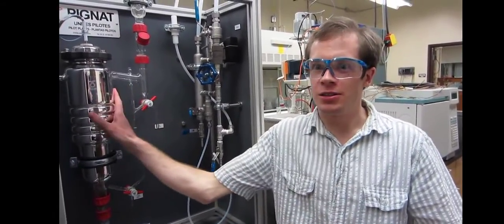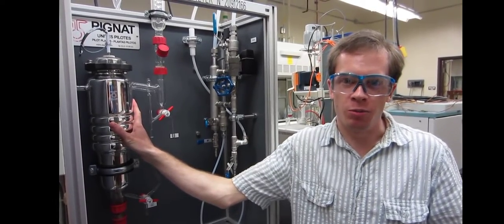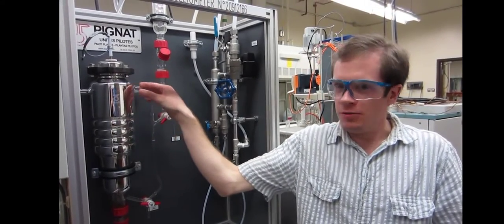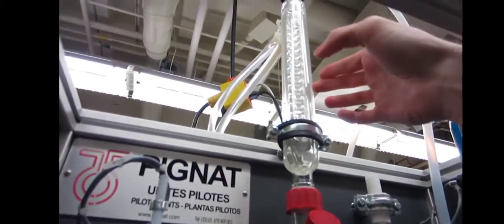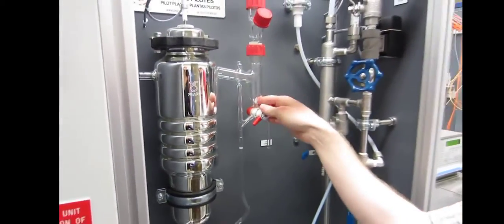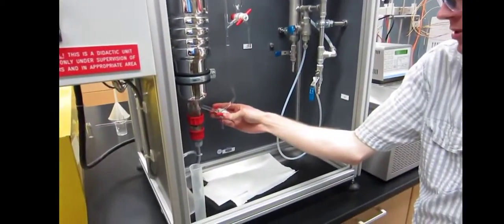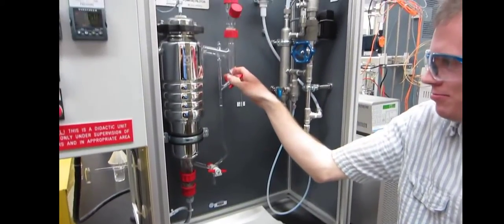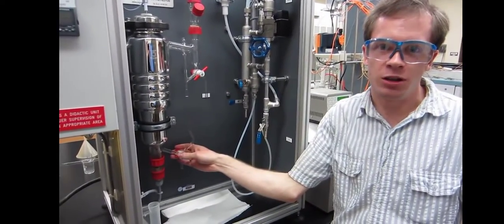So here we've got the reboiler. We just call it the pot usually, where we're boiling the mixture we've got. The vapor comes up through this area up into the condenser here, where it all condenses, falls back down through here, and then is fed back into the reboiling pot. And here we can take samples of the distillate, and here we can take samples of the liquid. The distillate tells us what our vapor composition is, and this can tell us what our liquid composition is.